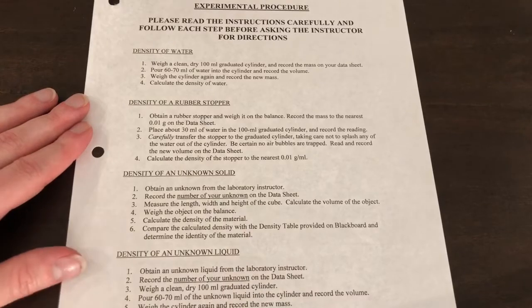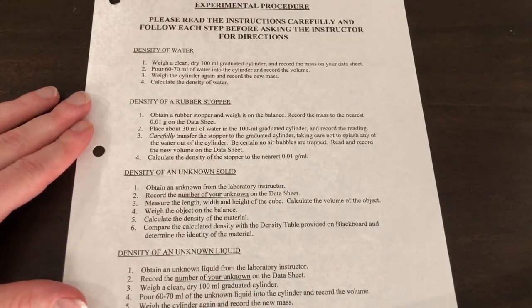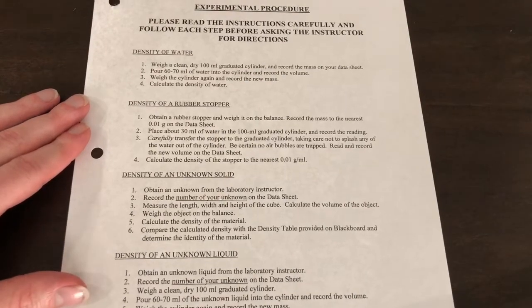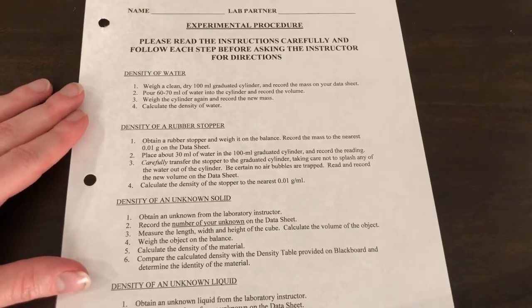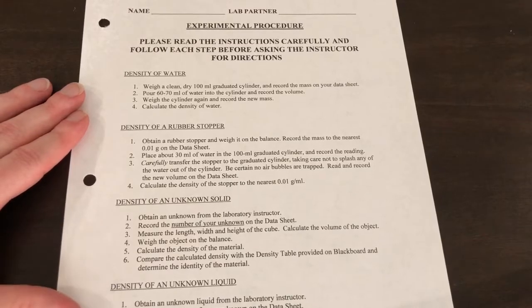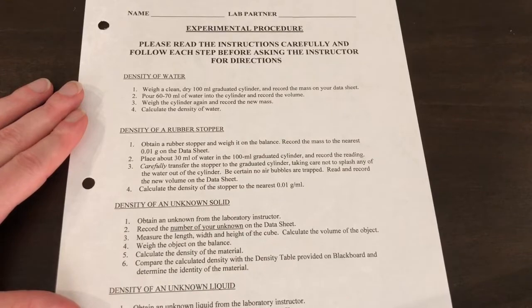and you're going to calculate the density of the material by doing mass divided by volume. You're going to compare your calculated density with the density table provided on Blackboard and determine the identity of the material. Just a little hint, one of them is probably going to be aluminum, and the other, I believe, was brass, okay? So let's see how close we get to the actual density for those metals.